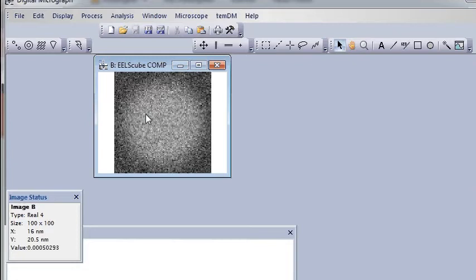In PCA we choose several principal directions and discard the other ones. It means that in that example it was 2000 energy channels, 2000 dimensions in energy space, and we reduced that to 5. And let's continue to rotate, but now in the reduced 5-dimensional space.